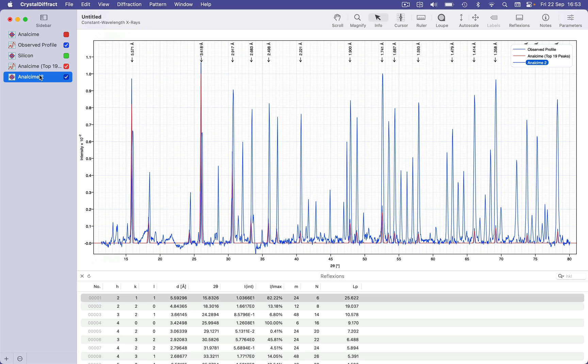So that's an introduction to working with observed diffraction data in CrystalDiffract 7. It is designed as a quick and easy experimental workbench.